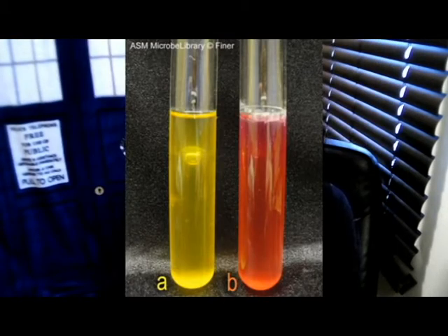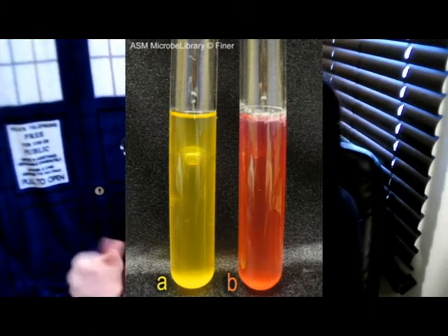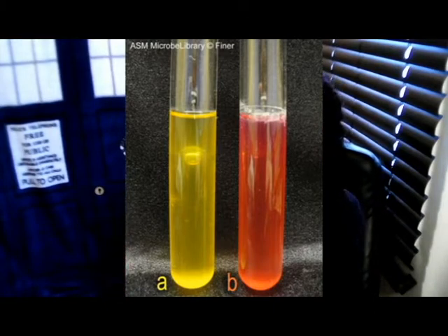Okay, so the fermentation of a single saccharide, we found positives. If they changed color from the red, they began as red, right?